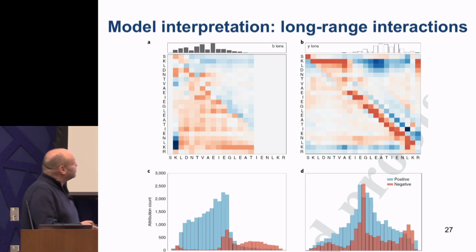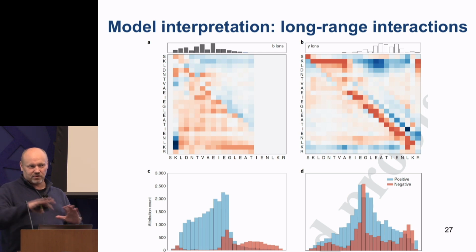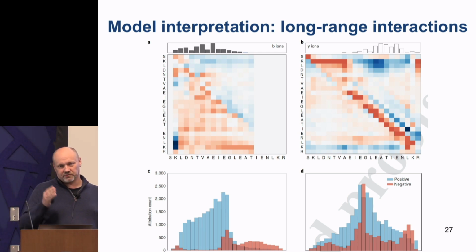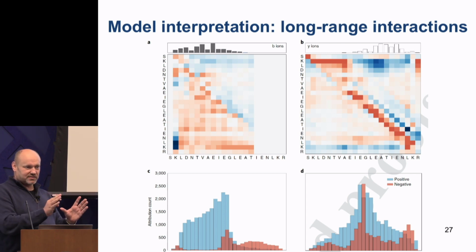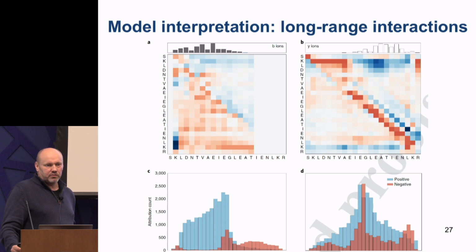This is actually instance by instance. It's not telling you for the whole training data what feature is important, but for one instance, it's telling you what the important features actually were. So you would get matrices like this here, which tell you, for predicting this particular intensity at this position, which of the other bonds, which of the other positions in the peptide, were actually important to get to this decision.